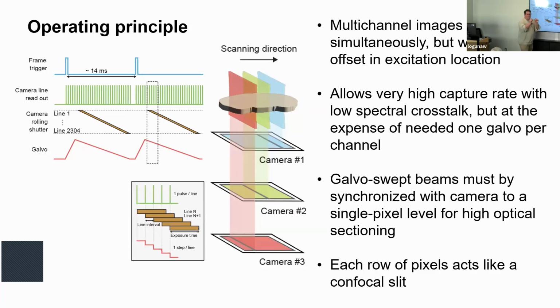Each camera is collecting a different part of the image at one time. And so when you watch it, there's a bunch of lasers that kind of go like this. Synchronized with that, all of the cameras are capturing. So you're able to collect a lot of imaging data at once because you have 3 cameras running at once, and they're all moving very quickly. That's the summarized version.